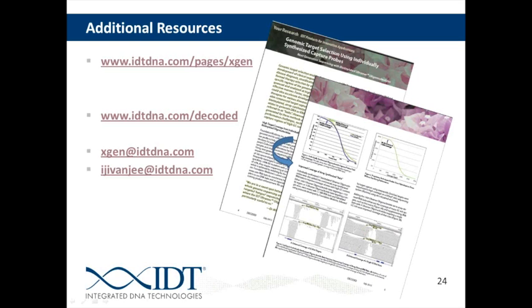So, for instance, with the 454 sequencers you sequence a fairly long amount of material, so you can have larger fragments and still cover the complete sequence. At the opposite end of the spectrum, SOLiD has very short sequencing runs, and so you need very small fragments of DNA to run in that. But as far as the enrichment goes, it's not as sequence dependent as the other steps in next-gen sequencing are. So follow whatever the manufacturer's instructions are for your machine, I guess, is the simple answer there.